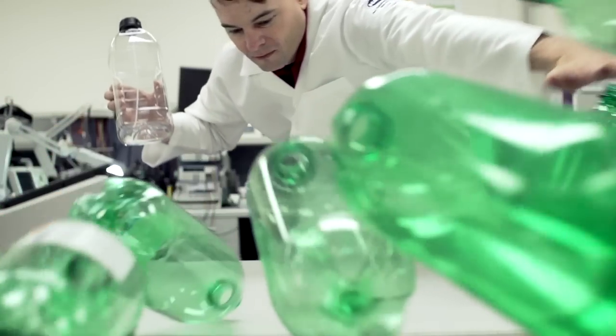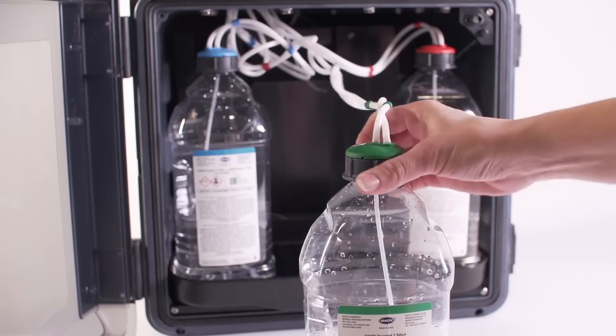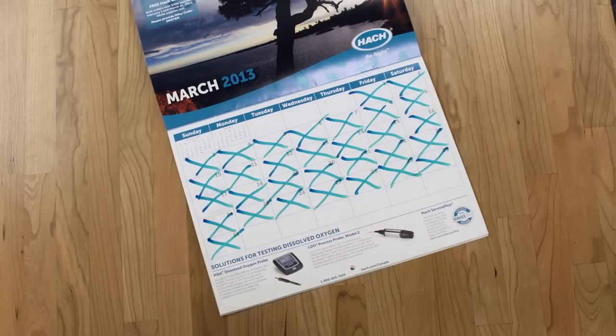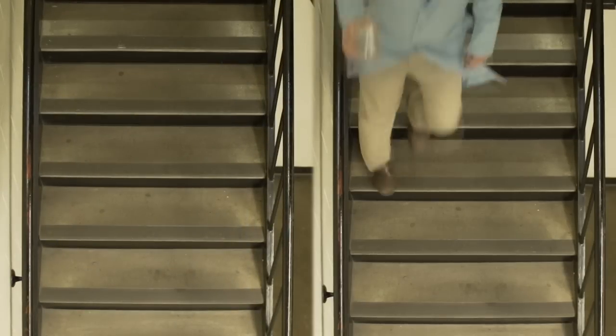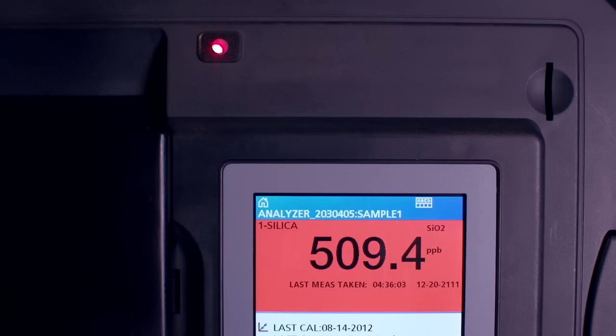We made new reagent bottles that won't tip, that open with a twist, that won't drip. We increased the lifespan of the reagent bottles. We made it easier for the plant to share with the lab, and the lab to share with the plant. We lit it up — warning lights, LED lights, lights you never replace.